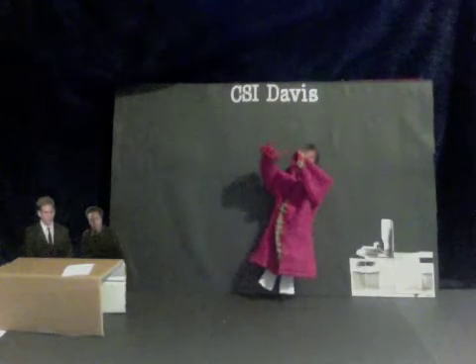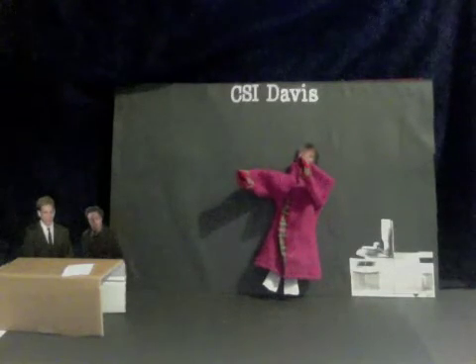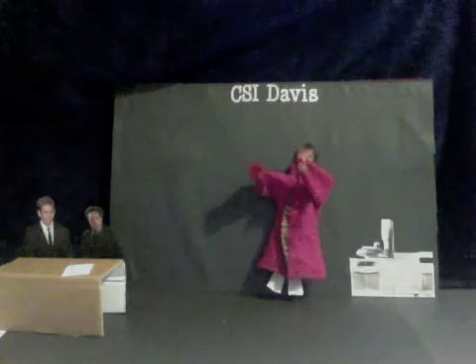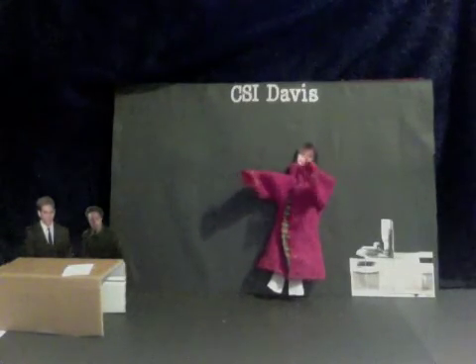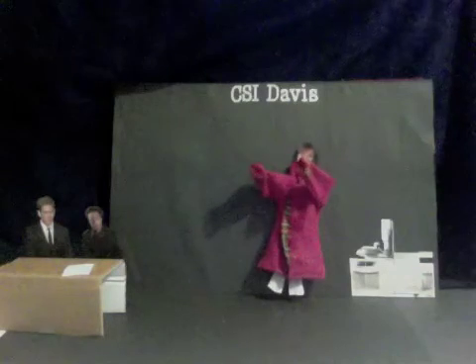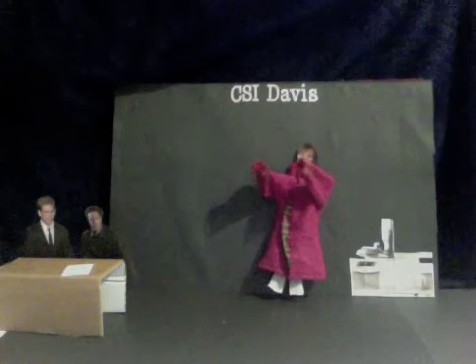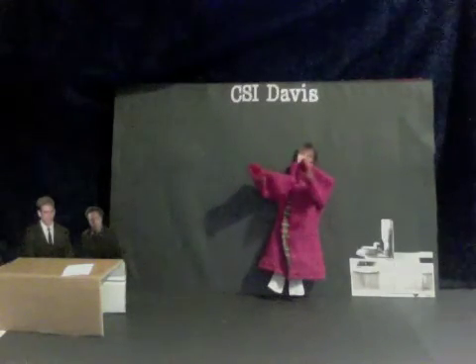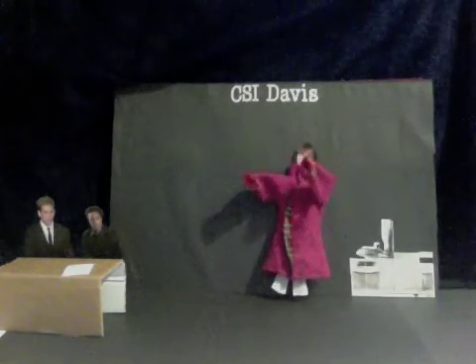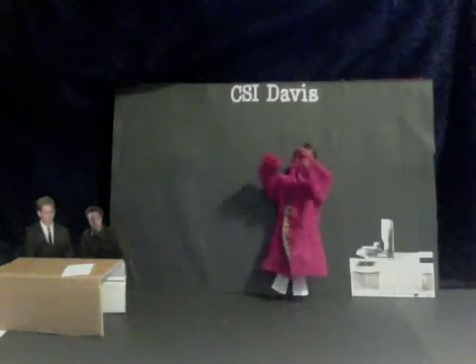Then, we get to the mass spectrometer, where the components will be separated by a mass-to-charge ratio. The mass spectrometer bombards the components with electrons to form cations. This happens in the ionizer part of the mass spectrometer. Then, an electric field will accelerate these ions, and another electric field will deflect these ions in a curve. Finally, we have a magnetic field which bends the ions in different ways. This will ensure the separation of the components by mass. Lighter ions will deflect more than heavier ions and will therefore elute off first.